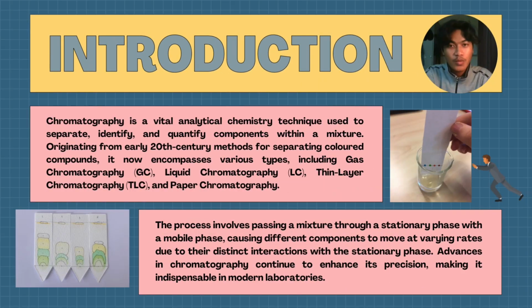I'm going to start with the introduction. Chromatography is a vital analytical chemistry technique used to separate, identify, and quantify components within a mixture, originating from early 20th century methods for separating colored compounds.